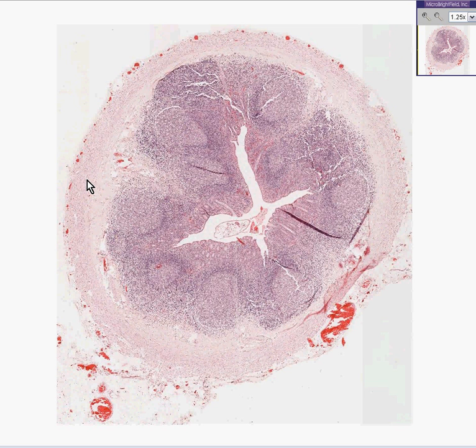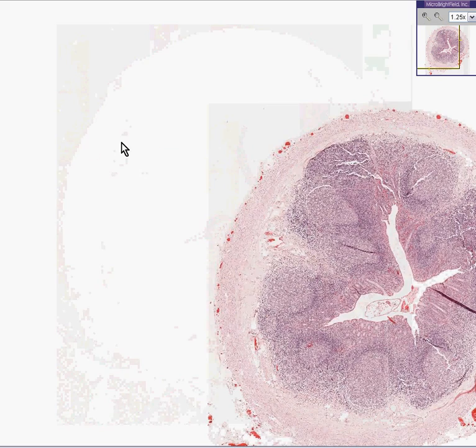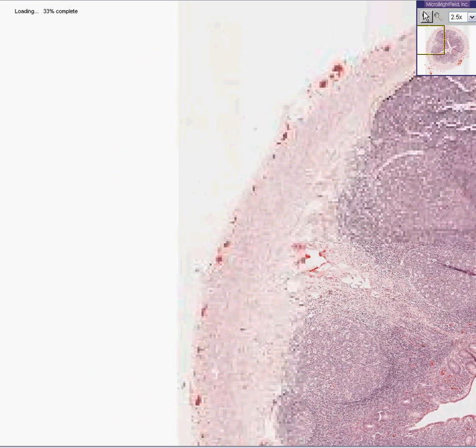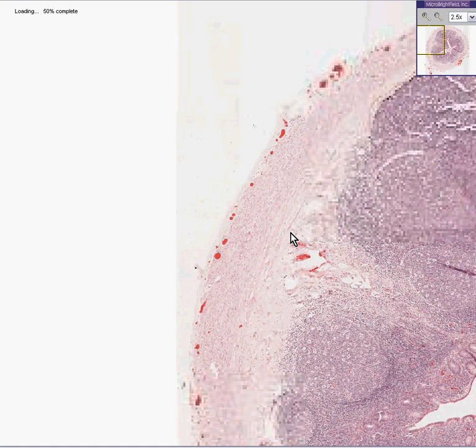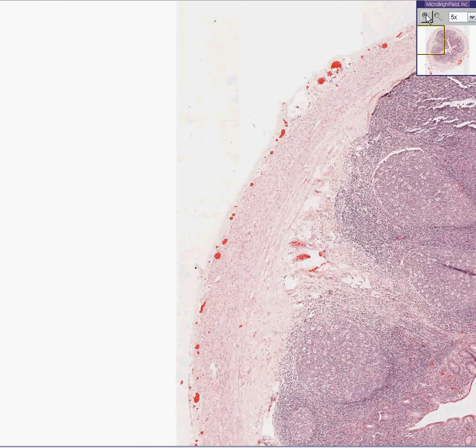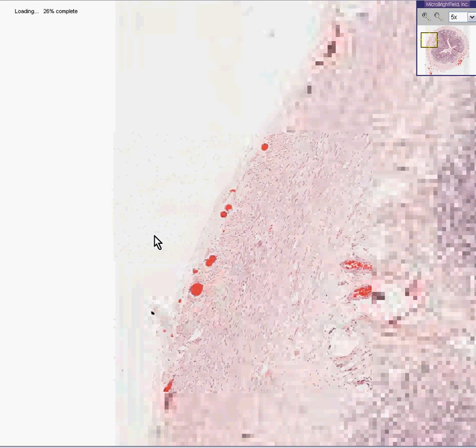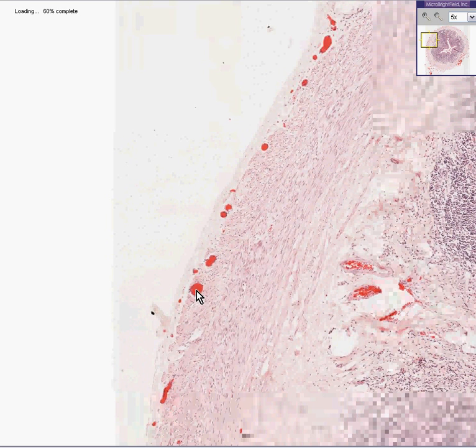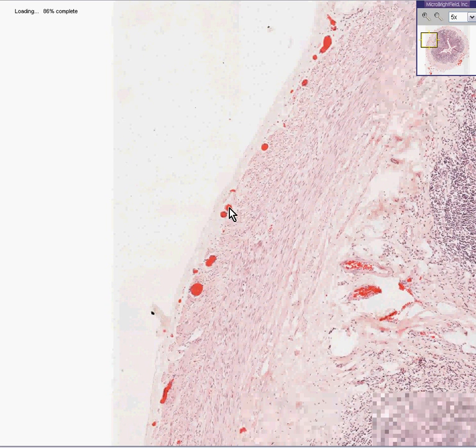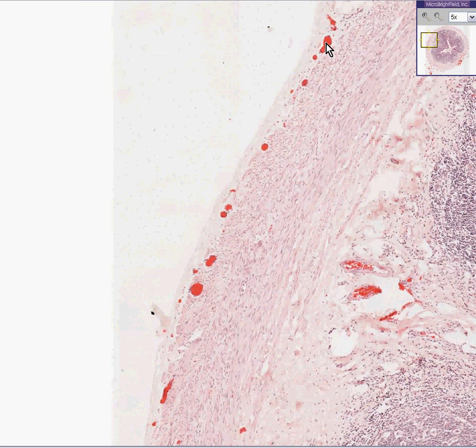But you might be thinking, well, that's only one phase of an infection. What about the phase in which you just have dilatation of blood vessels? That's a very early phase of acute inflammation. And in this appendix here, you could see that in the serosa, the blood vessels are quite prominent. So all that means is that there is hyperemia in the serosa due to any cause.